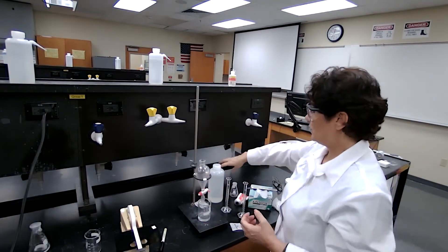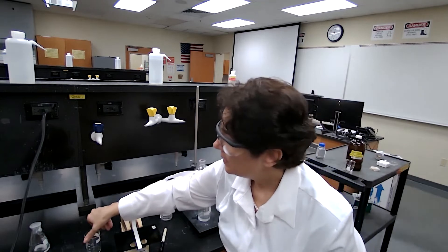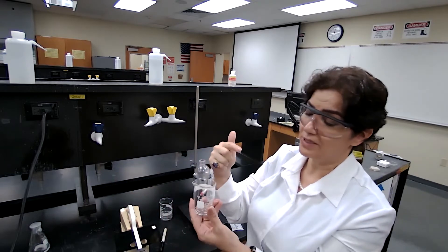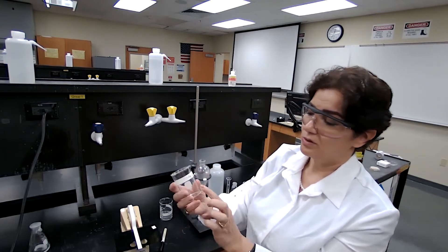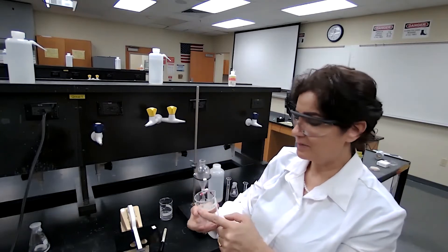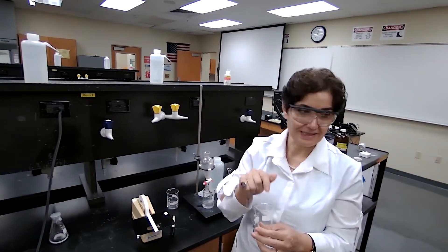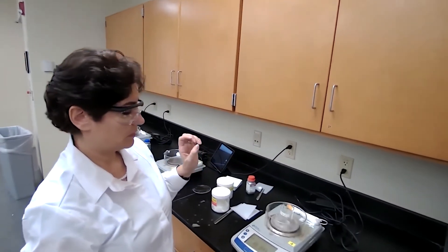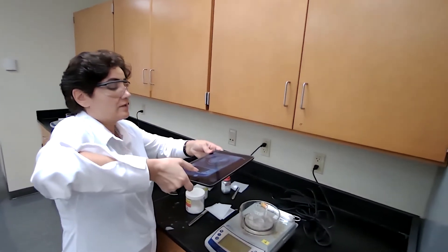While waiting, I can prepare my beaker — label it, because after the sample dries I'll be transferring into a clean, dry, pre-weighed beaker. Label the beaker, measure the mass of the empty labeled beaker. After three to five minutes, when the sample is dry, I'll transfer and decant into the beaker, having already recorded the mass of the empty beaker.